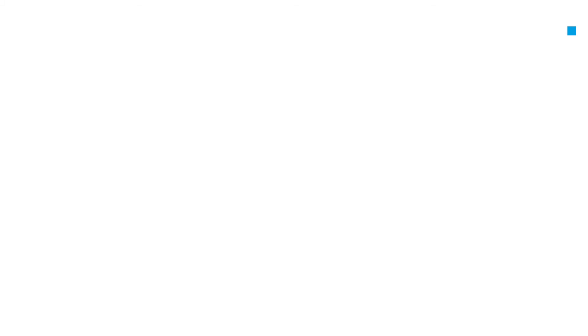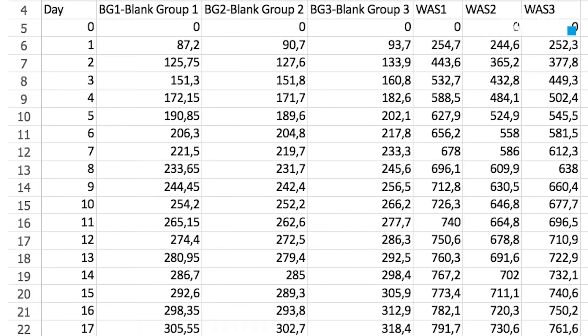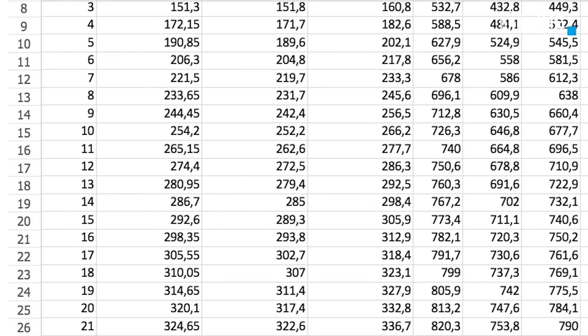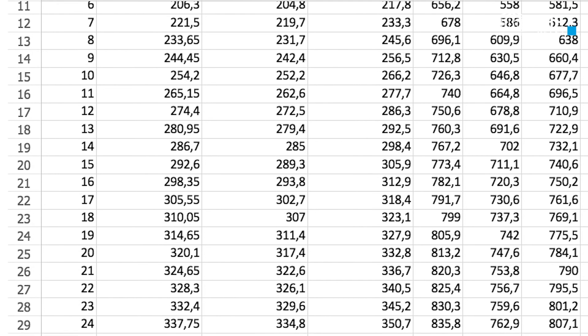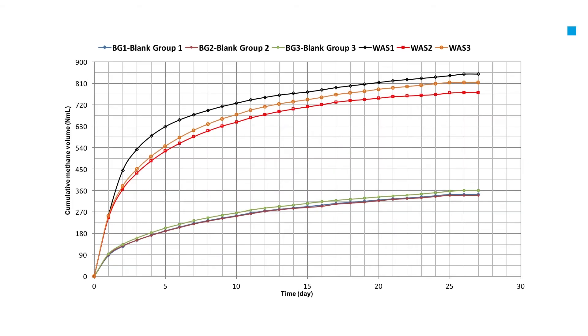After the test is completed, stop the program when the gas production has stabilized. Download the data from the program. Afterwards, use the data to draw the figure and carry out the required data processing to calculate the biomethane potential of the concentrated waste-activated sludge.